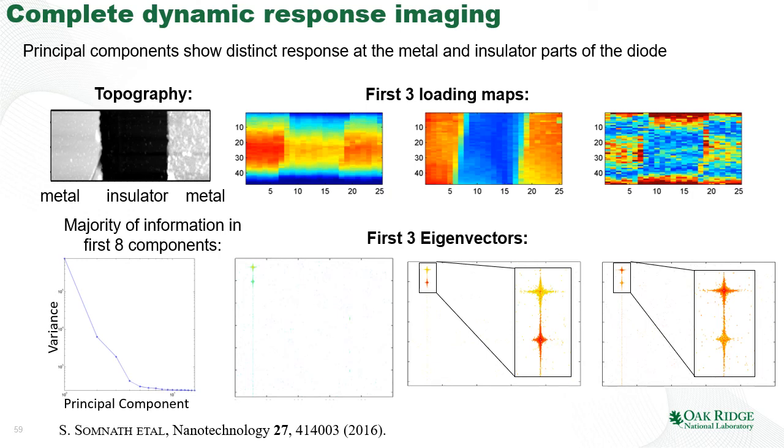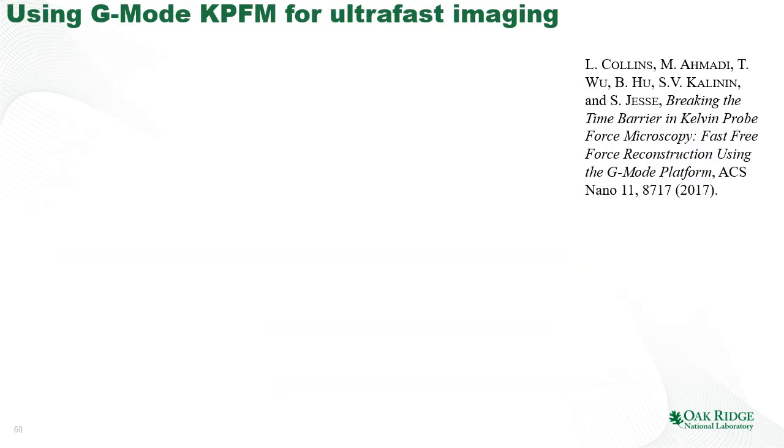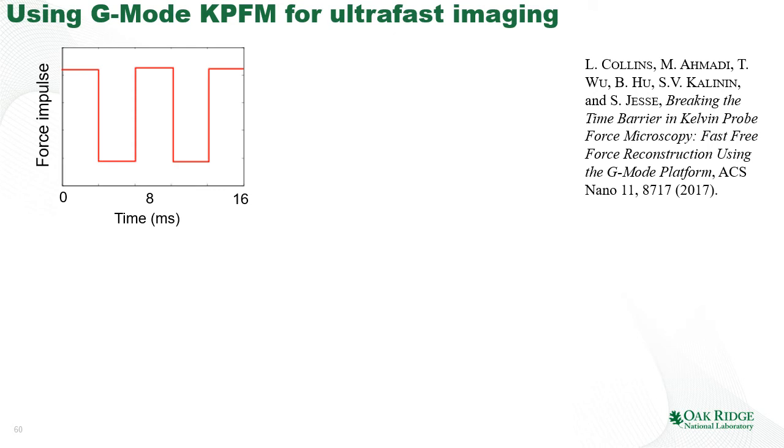But for the time being, this is a tour de force experiment. We know that we can do it. It works. It gives us something interesting, but until our capability to work with the terabyte volumes of data catches up with our experimental capabilities, we are probably not going to push it further. Now, what can we push? We can push the time resolution on KPFM.